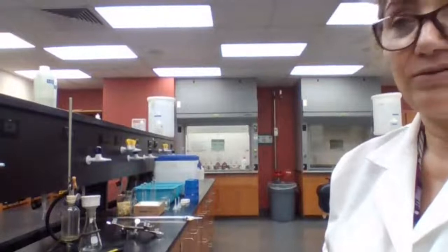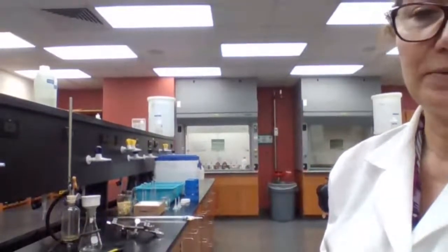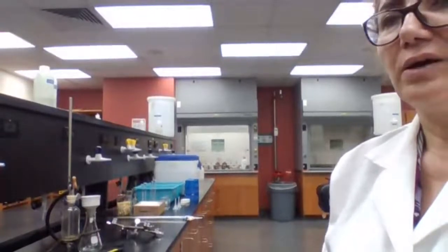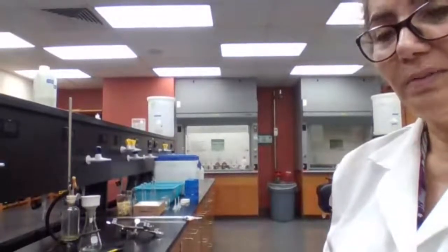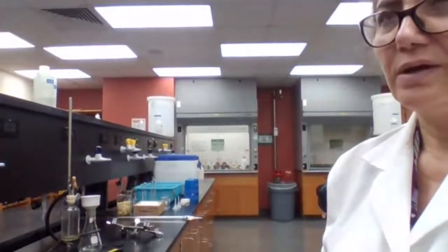You can at least narrow down, and then if you have a solid compound with the melting point, or with the liquid boiling point, you can narrow down your carboxylic acid and find the name for it, because you have the molar mass and you have either melting point or boiling point. You don't have to do derivatization for carboxylic acid.